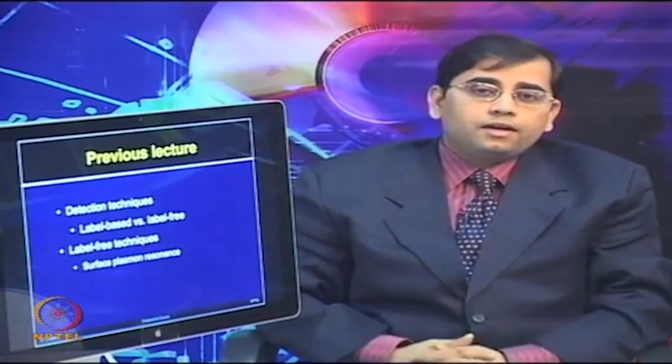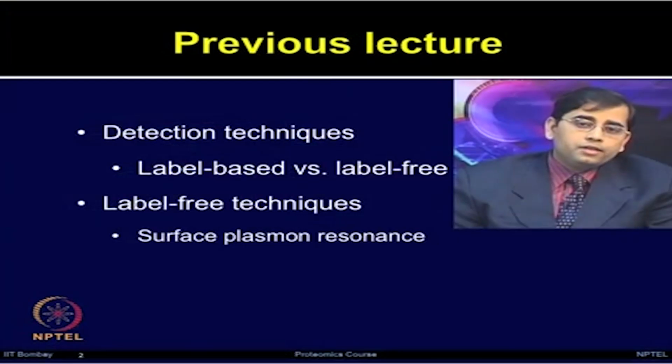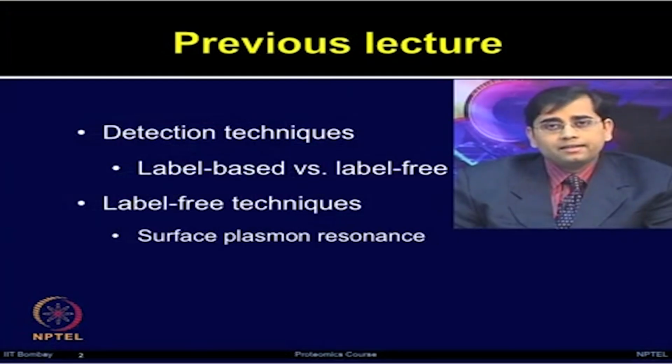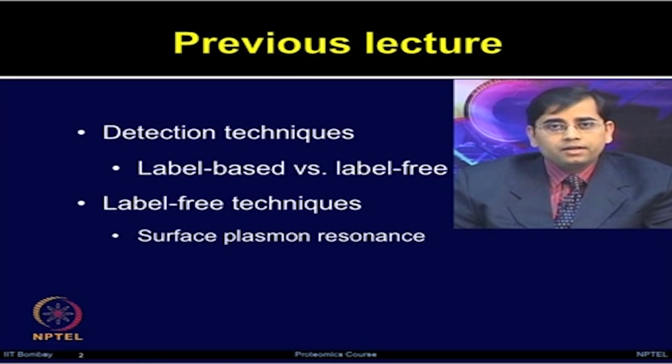So, today we will discuss from our previous lectures, which were more on the label based and label free comparison. Today, we will focus on the label free detection techniques, and we will talk more on the SPR imaging, different types of ellipsometry and interferometry based techniques.